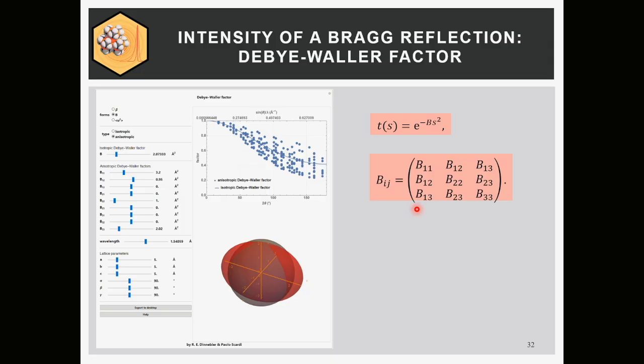What's a typical example? If you have rotating little crystals like triflates, which are highly anisotropic, or if you have an extremely polarizable big rubidium atom and a couple of carbon atoms, then it makes sense to refine them anisotropically. But usually it's too dangerous. You get a good fit, but it's meaningless. So in powders, I would say it's already a challenge to get individual atom displacement factors.